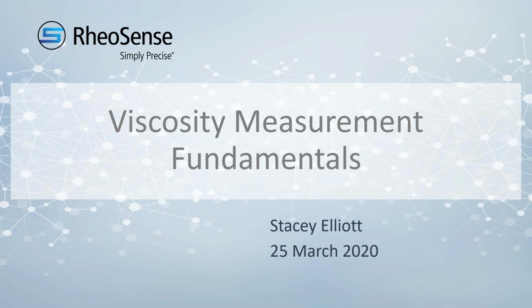So today's topic, as you can see, is what we're calling viscosity measurement fundamentals. After we decided on this topic, I realized that this is an extremely broad topic. As you might expect, there are entire books and week-long short courses on rheology, much of that being dedicated to viscosity measurement.